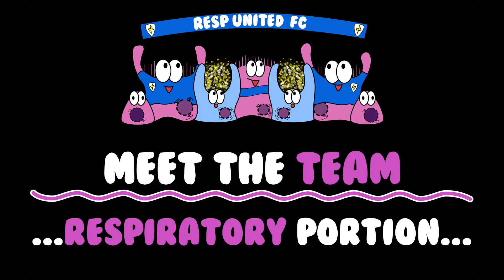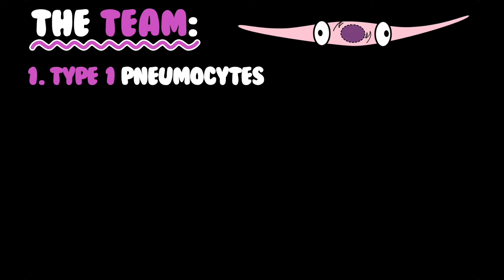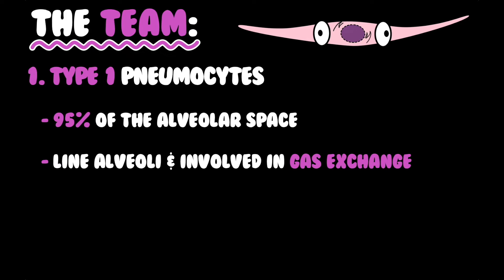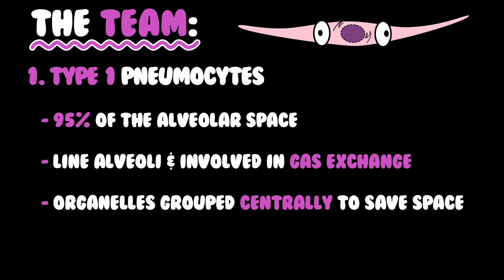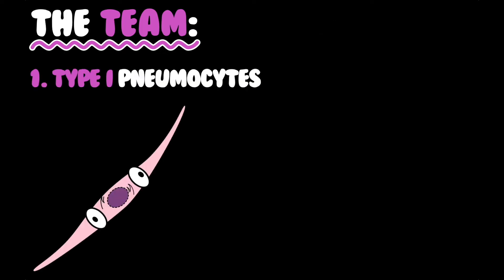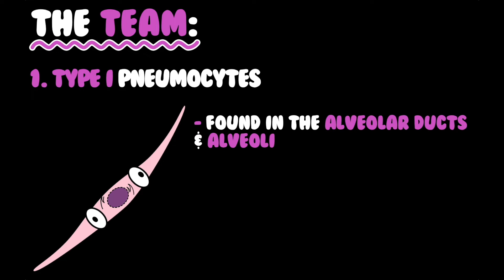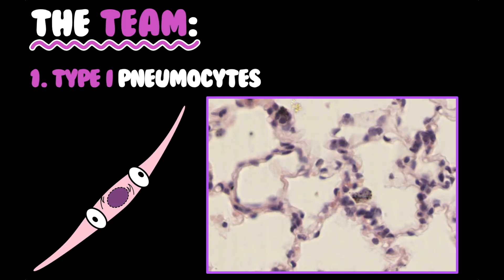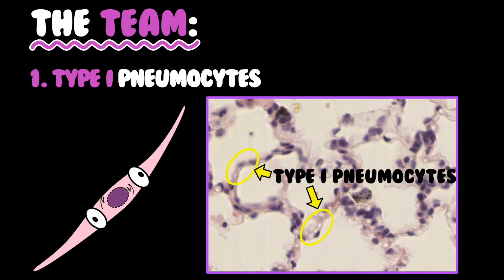Now meet the team — the respiratory portion. First, type 1 pneumocytes. These constitute 95% of the alveolar surface. They line the alveoli and are involved in gas exchange. Their organelles group centrally to save space. Type 1 pneumocytes are found in the alveolar ducts and alveoli and are extremely thin and slender in morphology. Here you can see multiple alveoli and our type 1 pneumocytes.